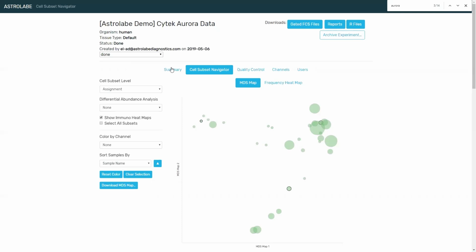As Janelle explained at the beginning of the webinar, when we have a spectral analyzer, you very likely will have a higher number of detectors compared to the number of fluorochromes in the assay. In the case of the data presented today, for example, we have a 33 color assay and an instrument that has 64 channels.